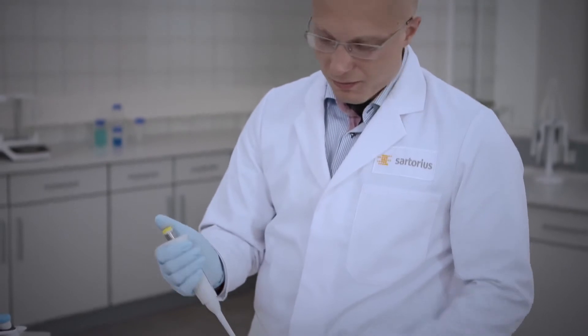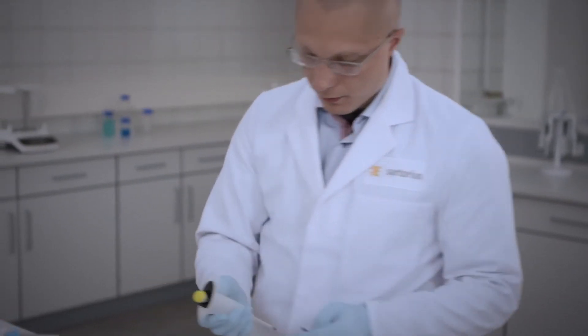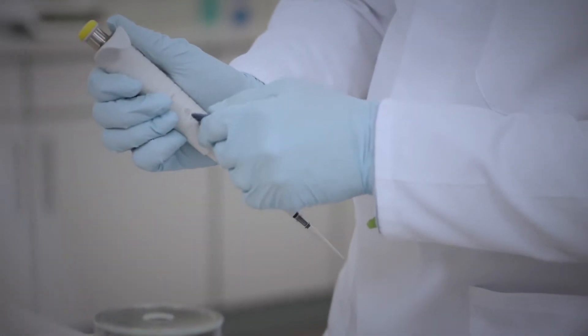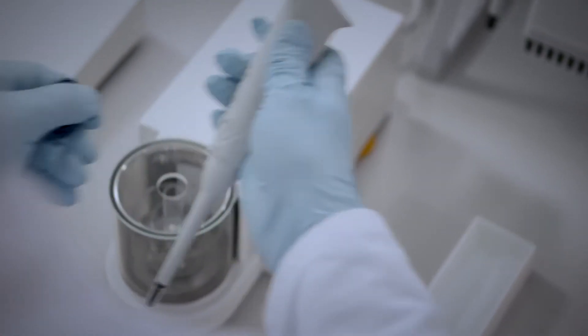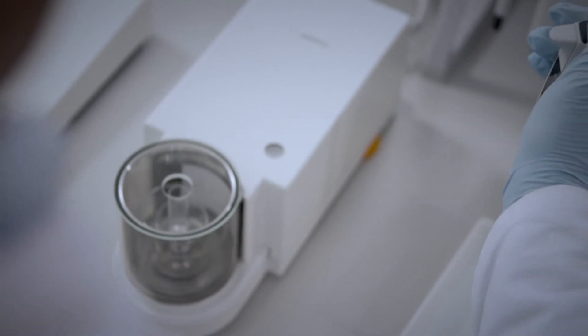Pipettes can often be adjusted to correct for accuracy using special calibration tools. A turn clockwise will increase the dispensed volume while a turn counterclockwise decreases the volume.